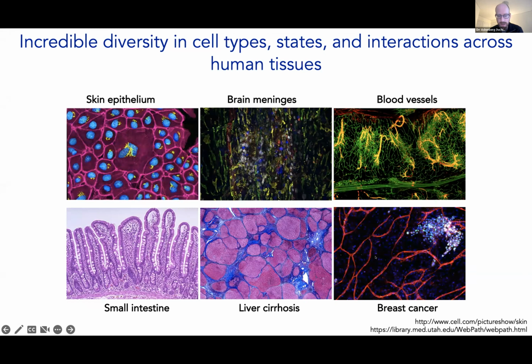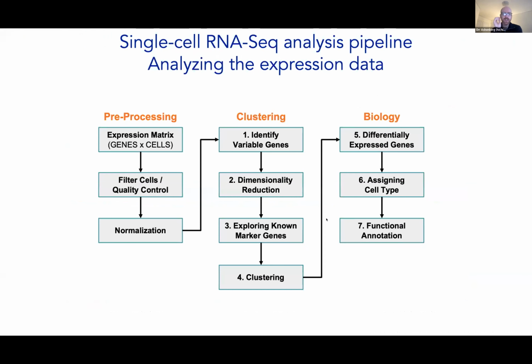And so we need computational methods to really identify these cell types and states once we have made these high throughput transcriptomic measurements. Daniel yesterday showed you the first part of the computational side, which is the pre-processing, where you did your single cell RNA sequencing experiment, took it off the sequencer, and did alignment of reads and generated a gene expression matrix.